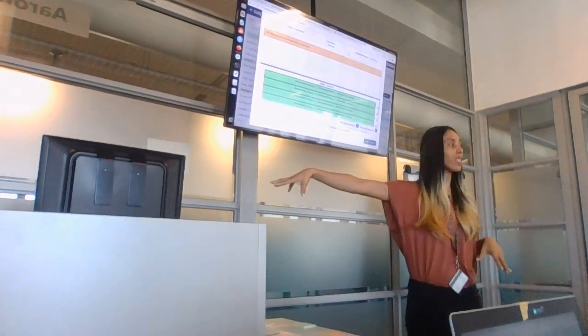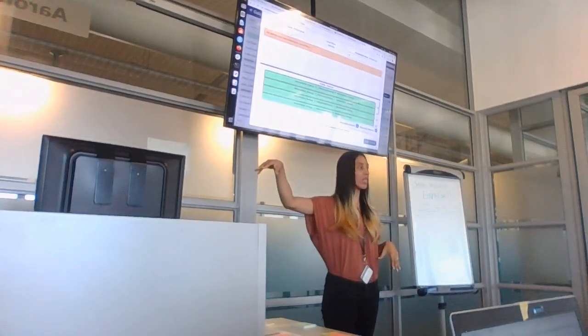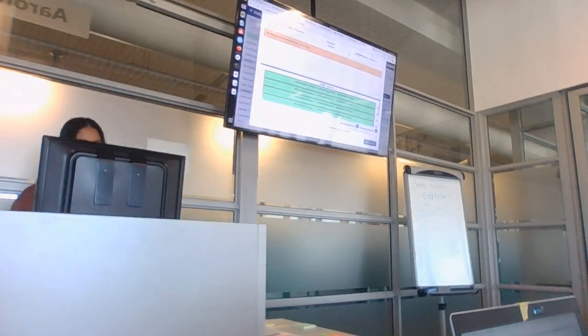These are clean data, so Galaxy has automatically paired the forward and reverse reads here at the bottom. You can see it recognized this is the file name, this is the forward, this is the reverse, and it did that for all of your files.